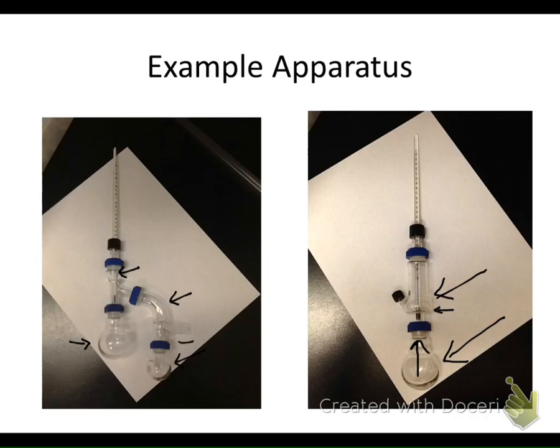Make sure you put in the O-rings at all these points, otherwise pieces just tend to fall off. And again, notice the position of the thermometer. The thermometer head is just below the Y of the Y adapter, and that again will give you a fairly reasonable temp estimate of the boiling point.